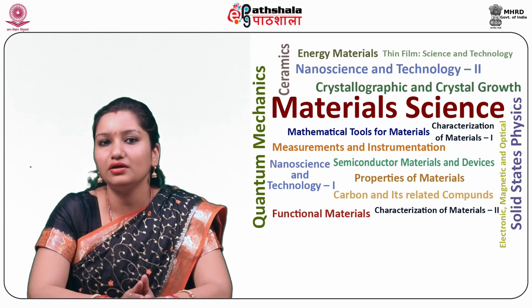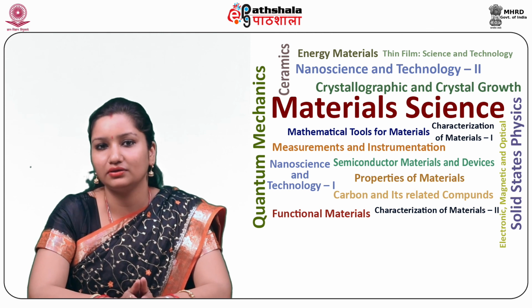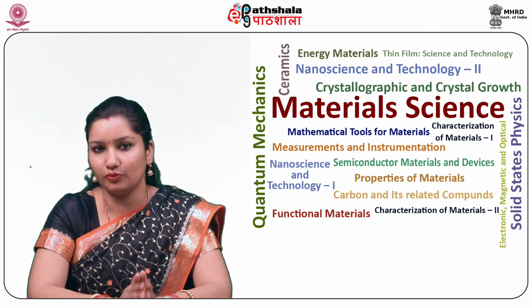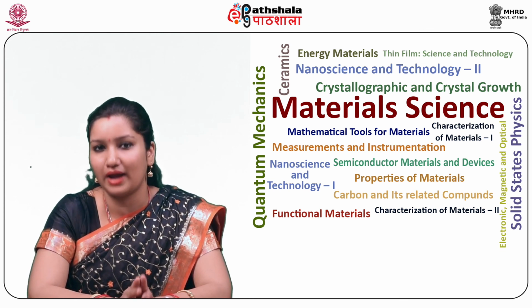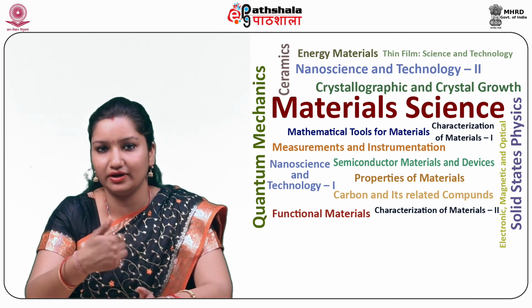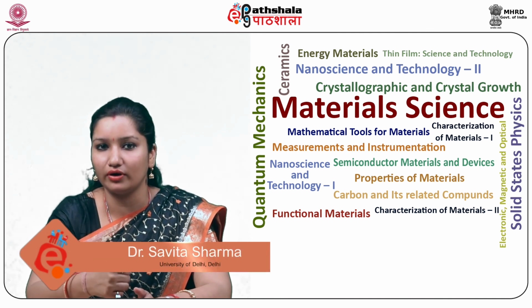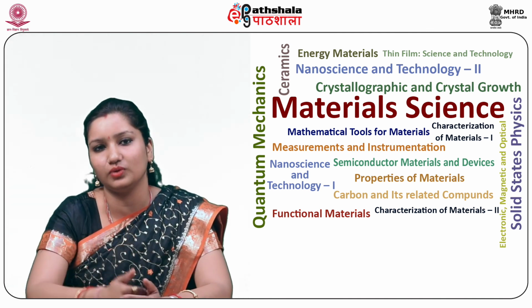Then in the end, we studied Bragg's law proposed by the two physicists W.L. Bragg and W.H. Bragg, which gave the mathematical form of X-ray diffraction and gave the conditions which are really important for X-ray diffraction to occur.